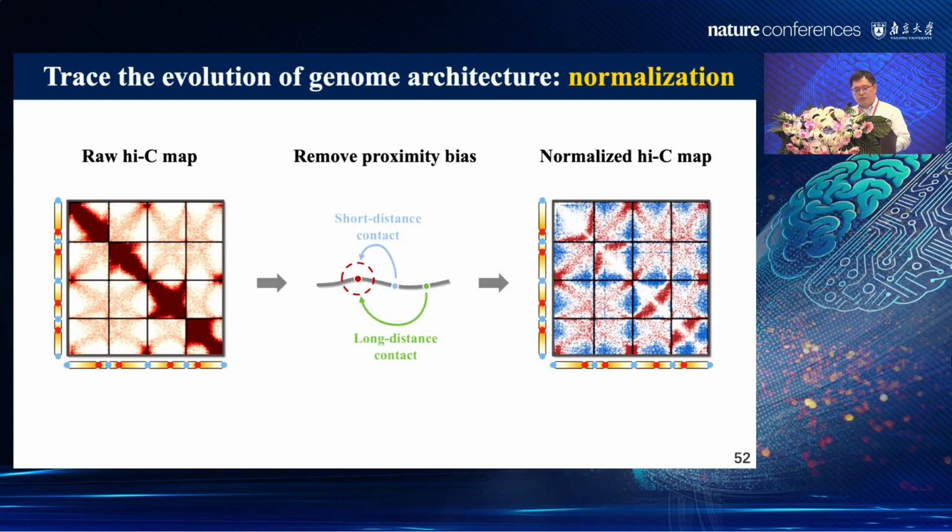Okay, so the data normalization. When we want to apply, for example, classification, and we look at the raw Hi-C data, it's really annoying that the diagonal line is dominating but doesn't really tell us a lot. Simply because when you have two genomic locations bound by a DNA filament, a shorter distance will certainly give you a higher probability of bouncing into each other than a long distance.